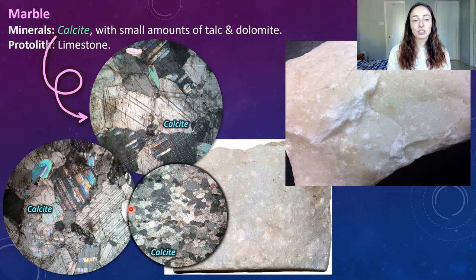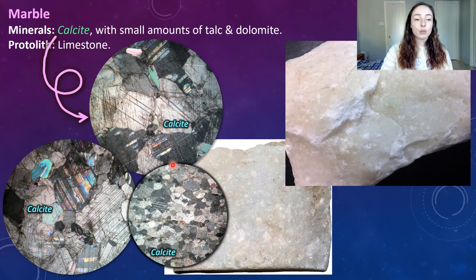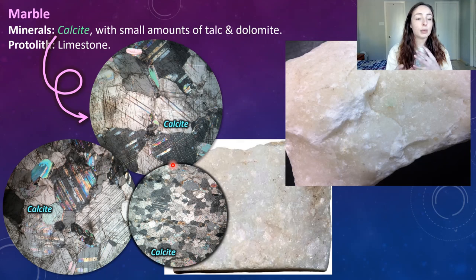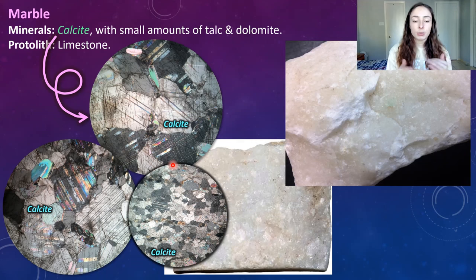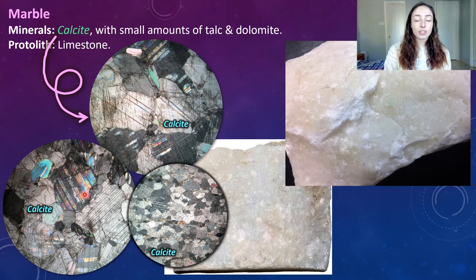Calcite and dolomite look similar under thin section, but what's really distinct about calcite is its three cleavage planes. You can see these lines on each of the calcite grains in these thin sections — those lines represent cleavage planes. If we were to rotate the thin section under the microscope, you'd see those lines change and appear differently as the grains change angle relative to the light. These show up as very light, pale interference colors under cross-polarized light.